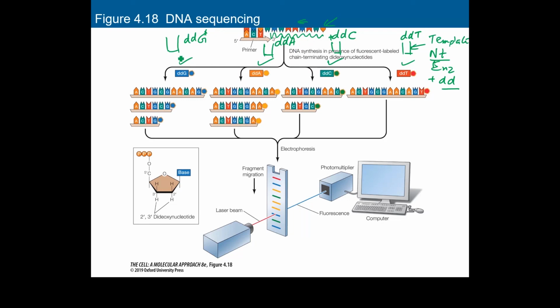So in one tube that has dideoxy-G, when this process takes place, where the extension of the template DNA occurs, wherever there is a G added, in some cases the G will be a dideoxy-G. That means it will not replicate further once the dideoxy is added. For example, we see that being done here, here, and here. Because there are G's that can be added in 3 places, it will produce 3 different fragments of different sizes.